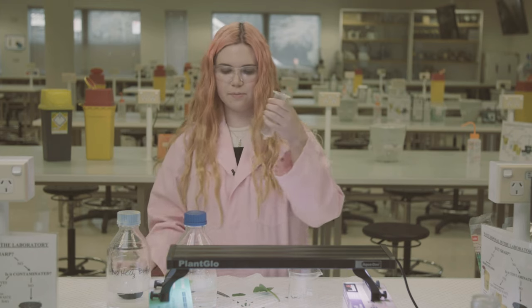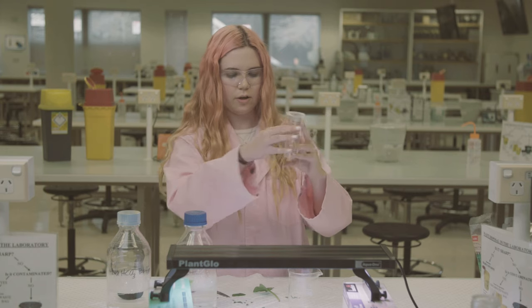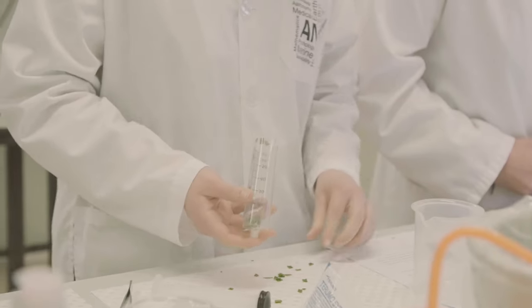Then we take a syringe, pull out the bottom, and put our leaf pieces in here, just blocking the bottom. Chuck them in here.